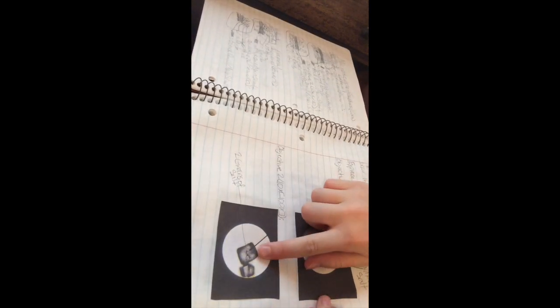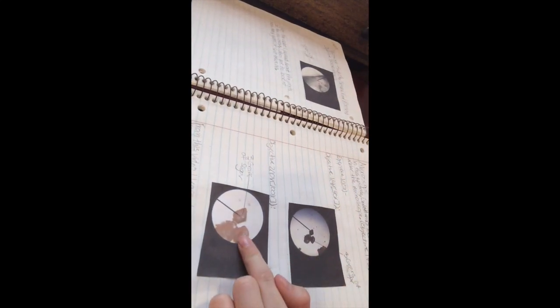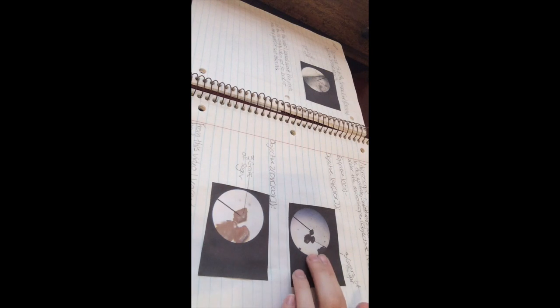If you look back at your pictures of salt, you can see that they were more speckled than sugar. It was also harder to get more in view because salt is a little smaller than sugar. And if you go back to sugar, you could see that there weren't many speckles. It was more just a plain square blob.